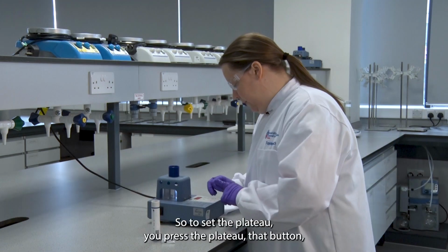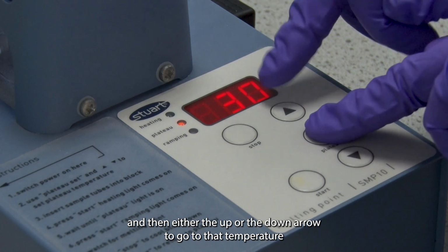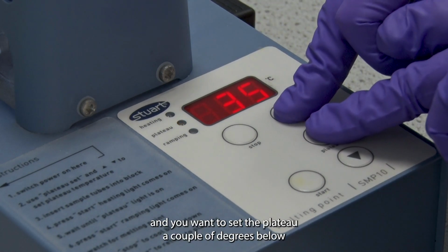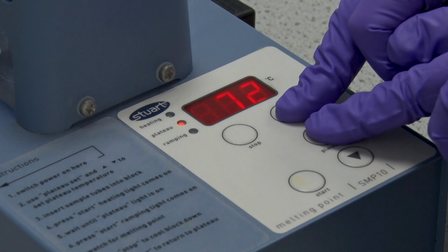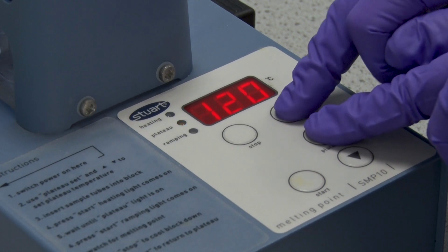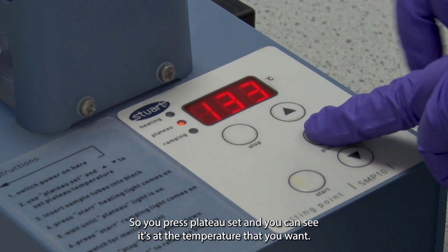So to set the plateau, you press the plateau set button and then either the up or the down arrow to go to that temperature, and you want to set the plateau a couple of degrees below what it is. So you press plateau set and you can see it's at the temperature that you want.